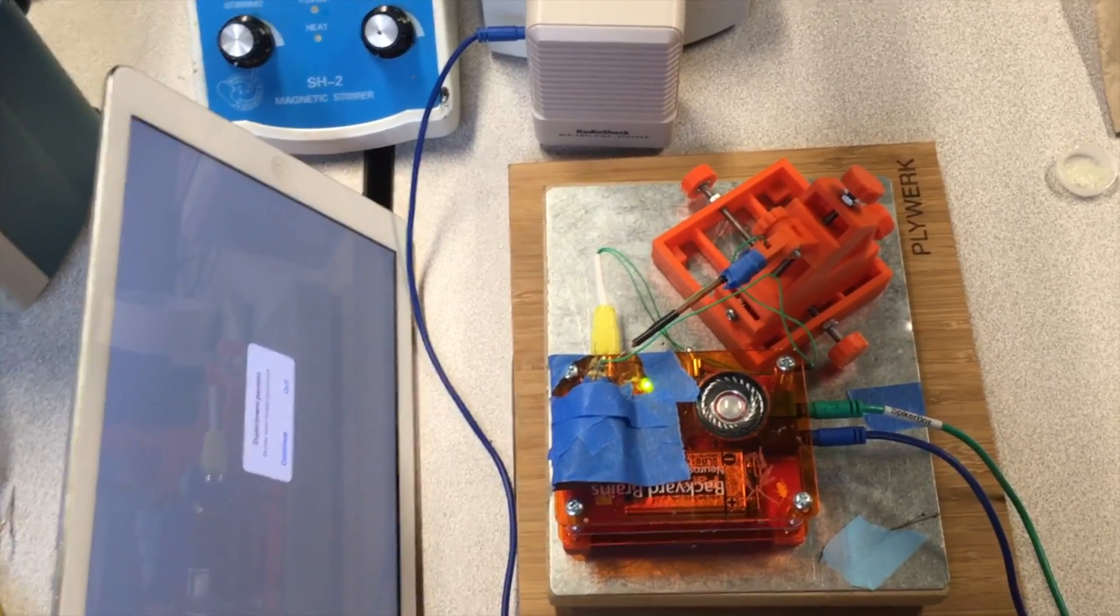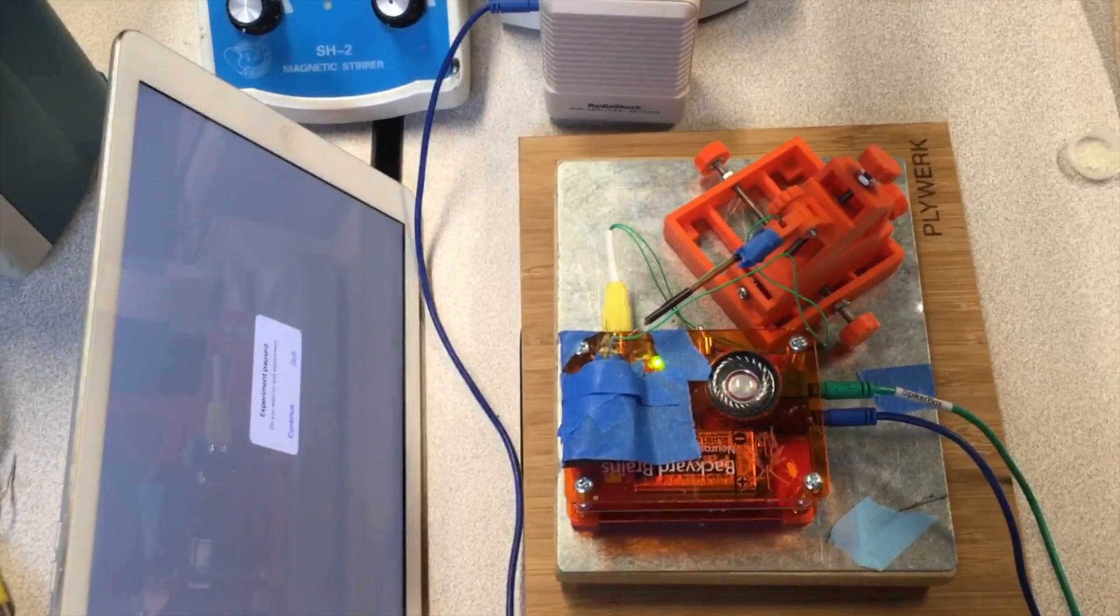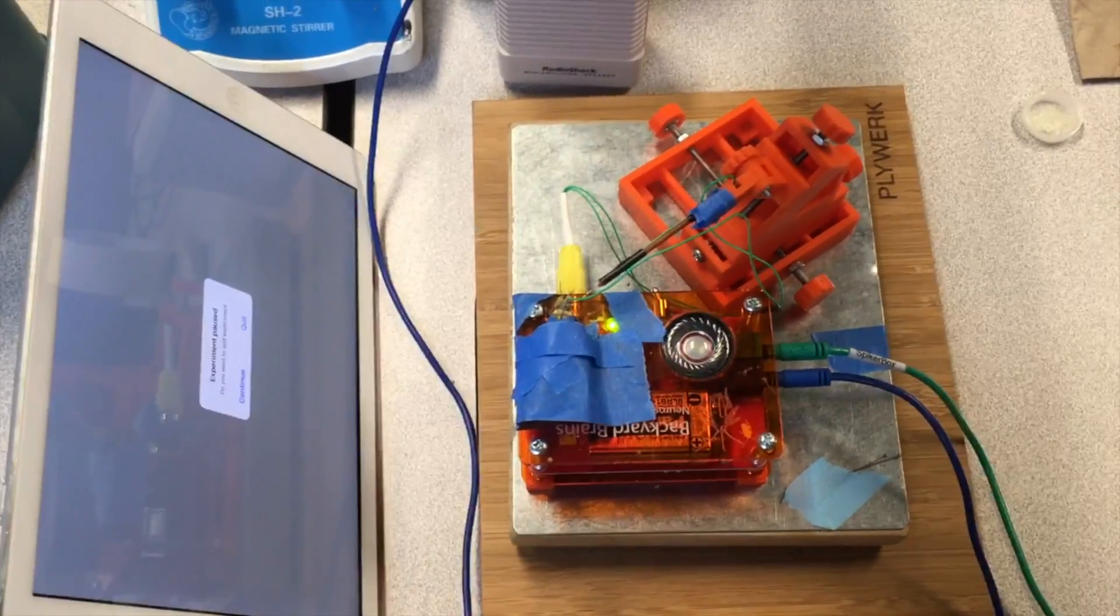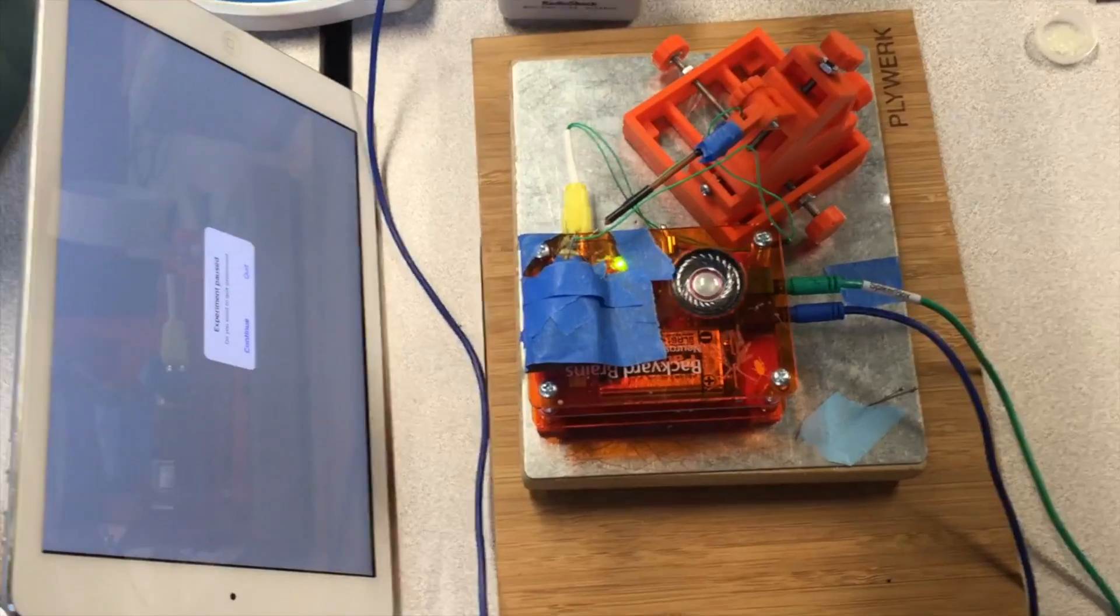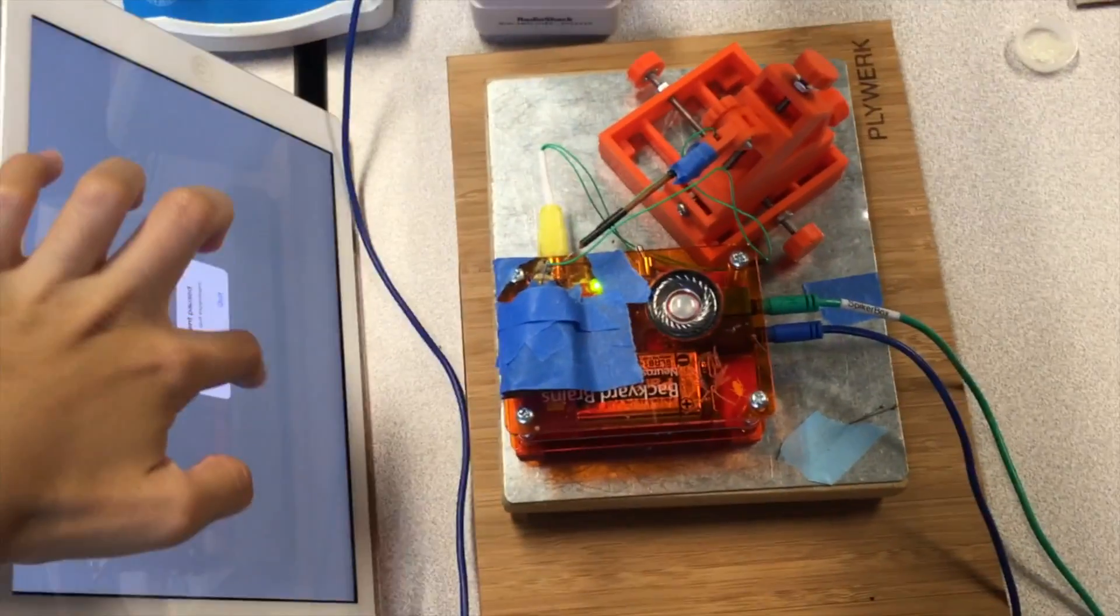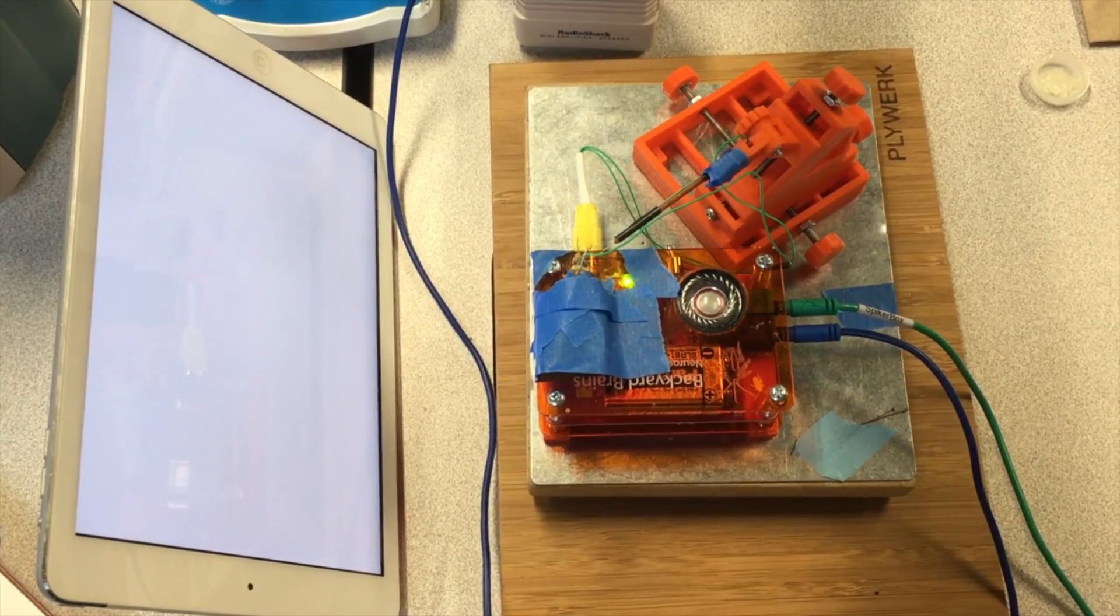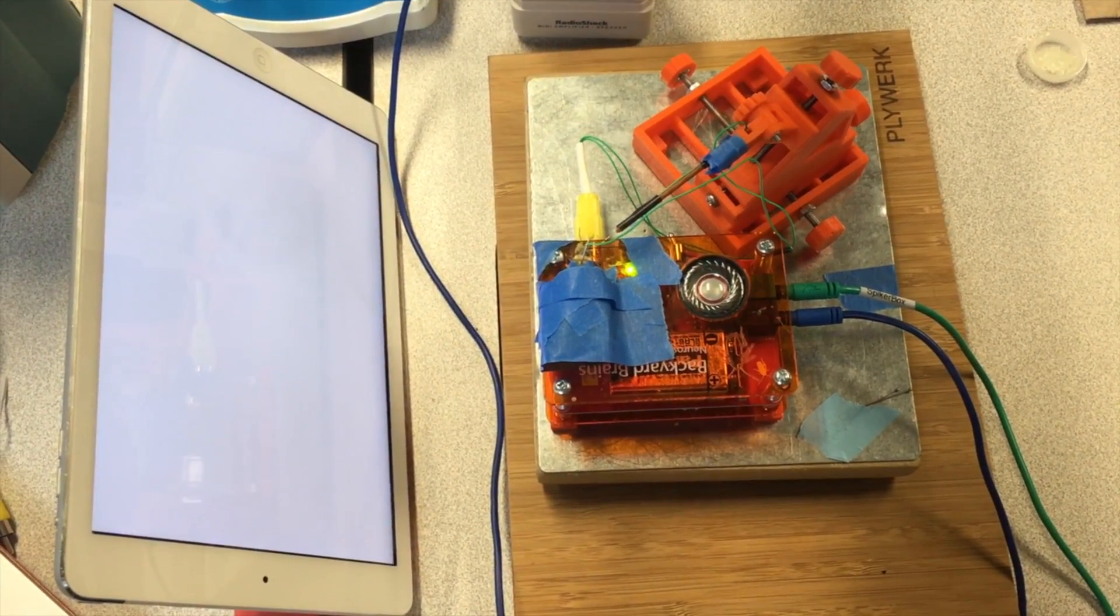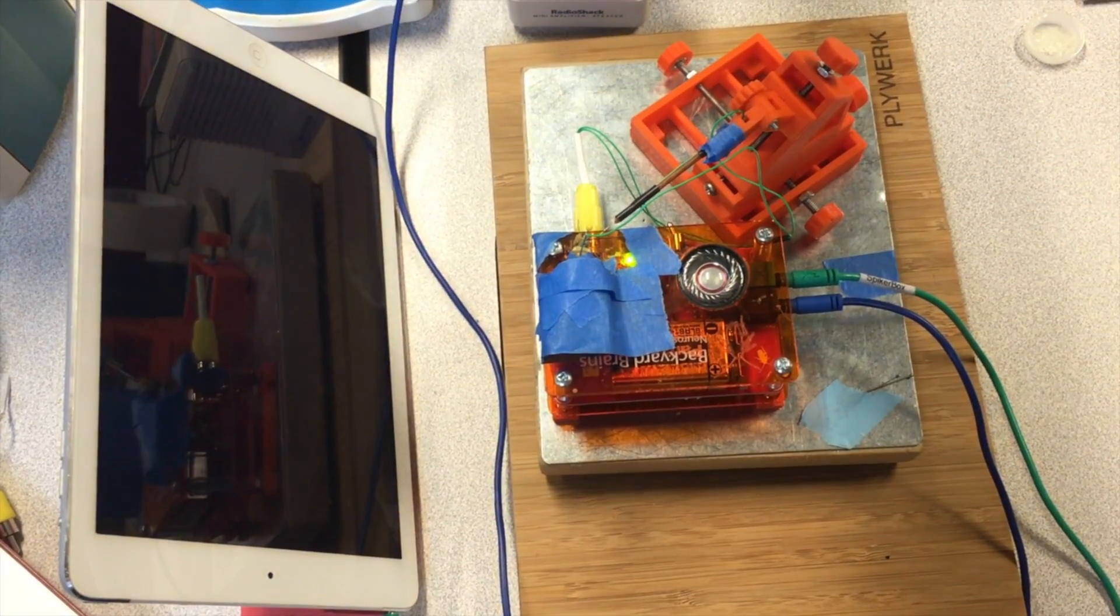So theoretically, the DCMD neuron will be very active and spike before the object hits the grasshopper, or in this case when the black ball fills up the whole screen. So let's see if we can hear some spikes. And that's a spike.